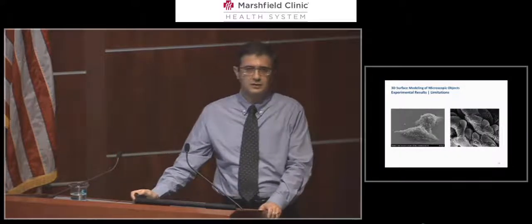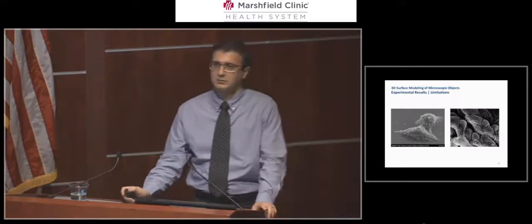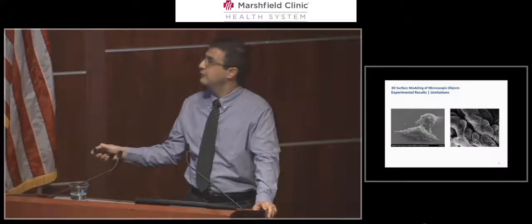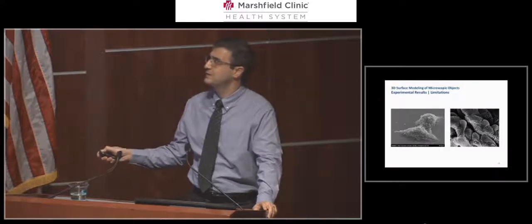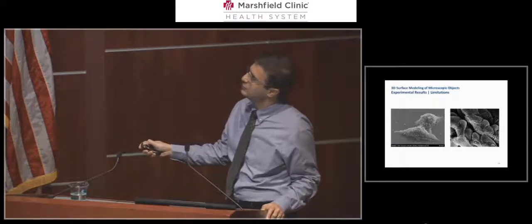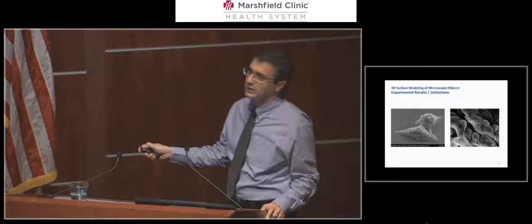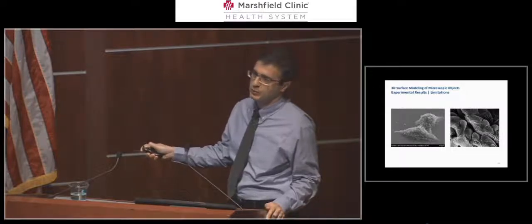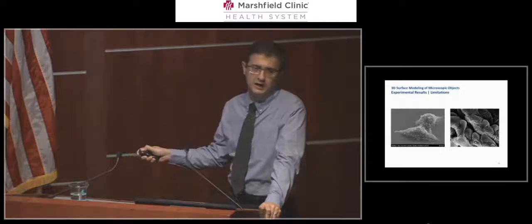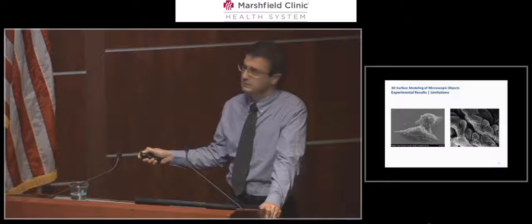There are some limitations. Our algorithm would not work on some SEM images. These are just a few examples. The first one: when we have dark areas, including shadows, the algorithm is not able to detect feature points, and it is also not able to explore the 3D surface model of the objects.